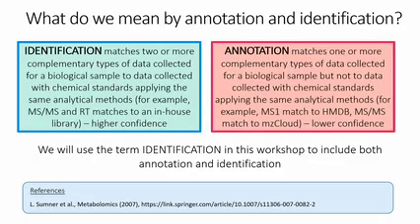So just before we go into the polling questions and some of the results, let's think about two terms that are commonly applied in metabolomics, annotation and identification. They're used interchangeably, and sometimes we're not quite sure about the definitions of each of those. So I wanted to talk about both of those. And really they are about the confidence that you have in the names of those metabolites that you provide.